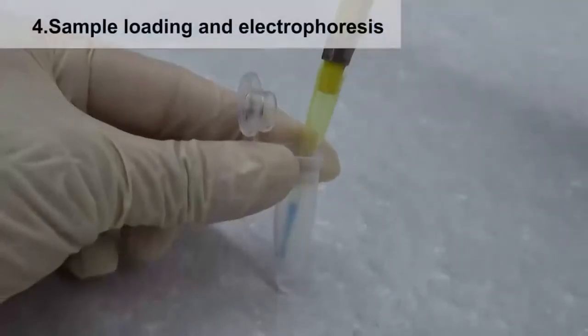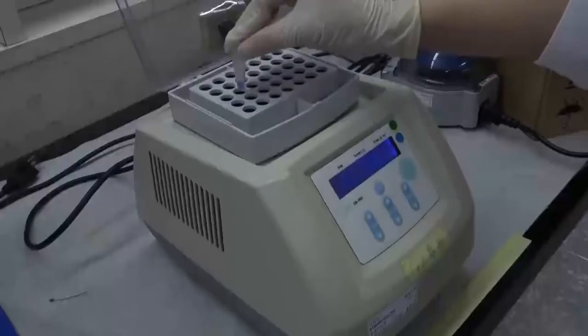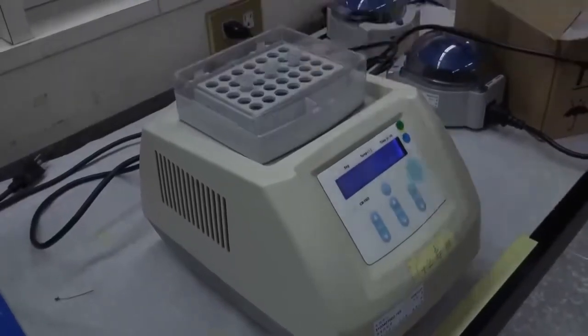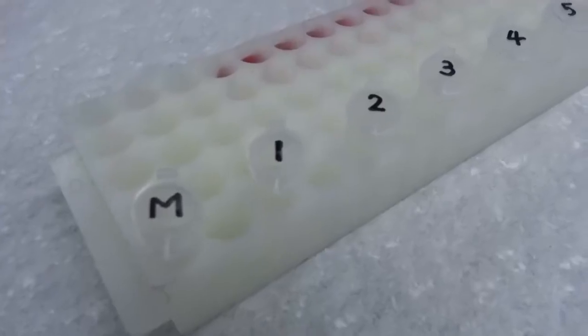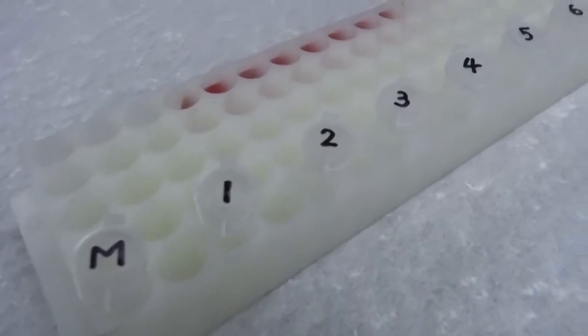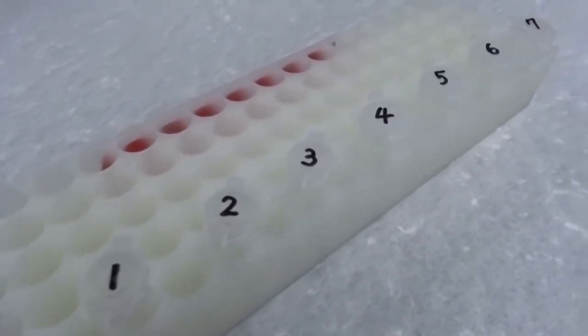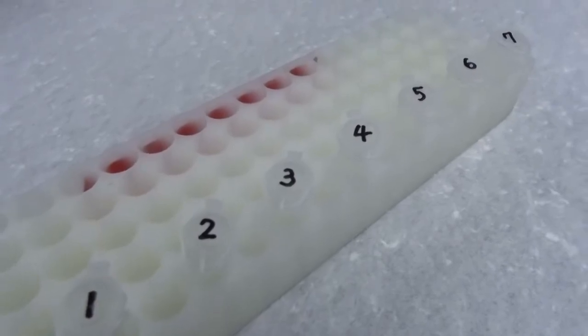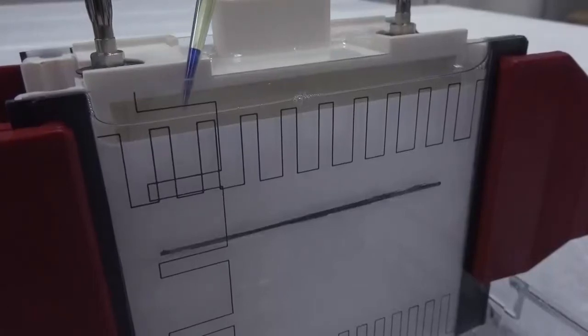Add samples into the sample buffer which contains a tracking dye. Heat the sample mixture at the specified temperature for certain time as instructed. Check the loading order. The molecular weight marker is usually loaded first, followed by sample 1, sample 2, sample 3, and so on.